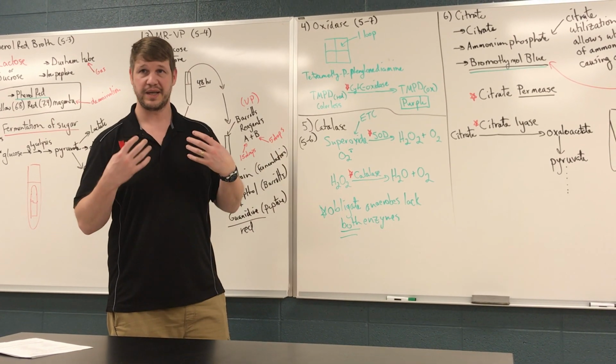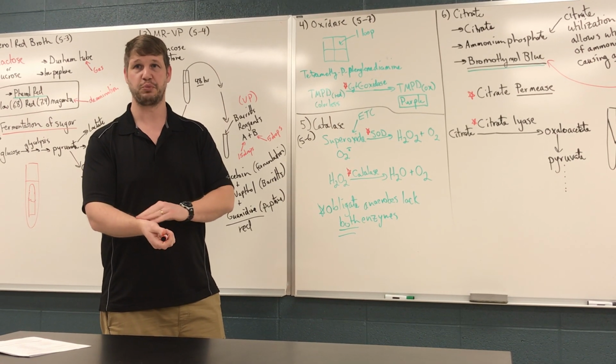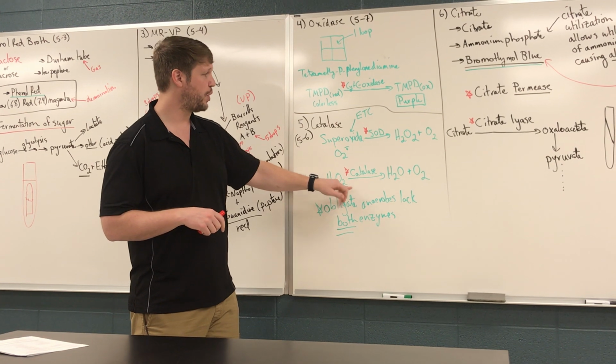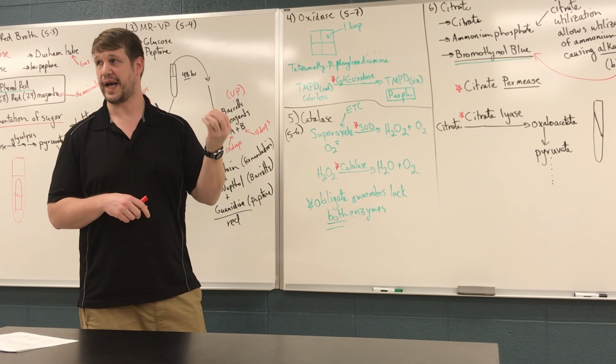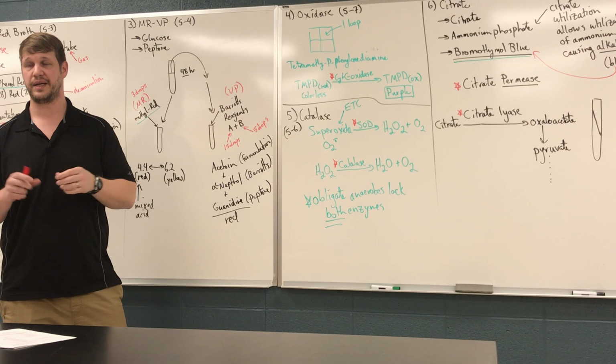We have catalase actually, in our blood, which is why if you ever put hydrogen peroxide on a wound, the hydrogen peroxide is going to decompose into water and oxygen. The bubbling that you see is actually oxygen gas being generated. So this is the same thing, same idea.